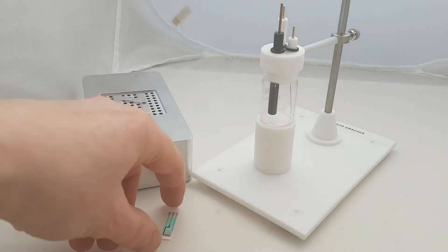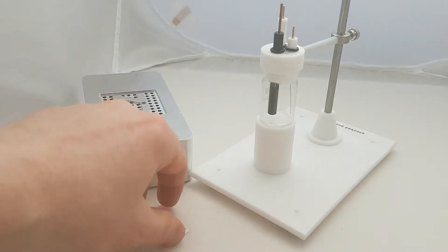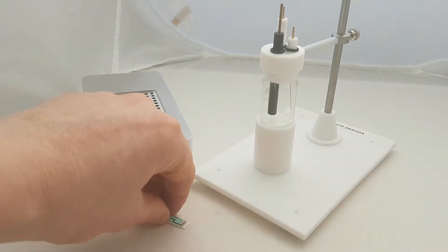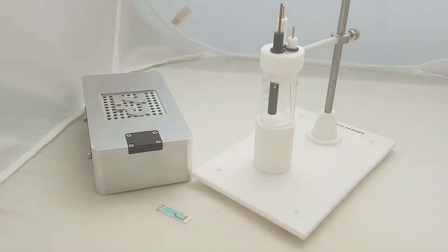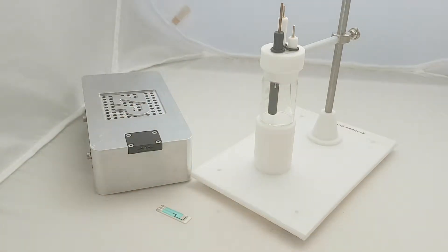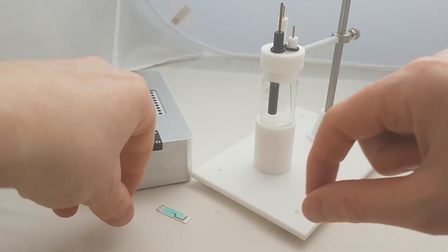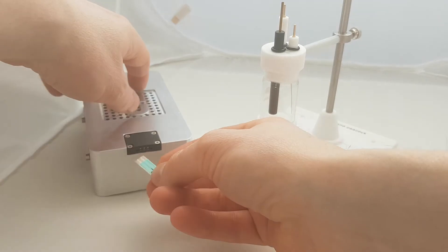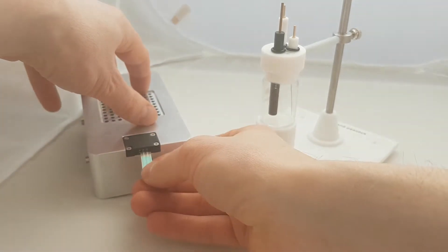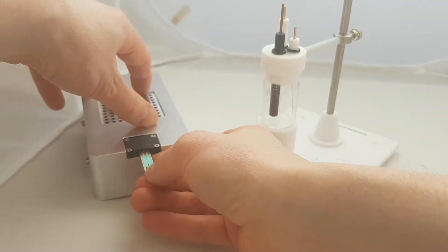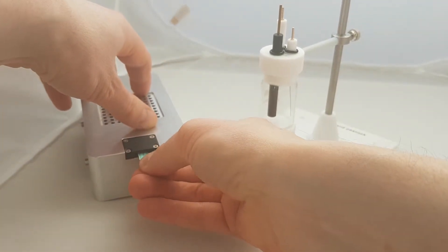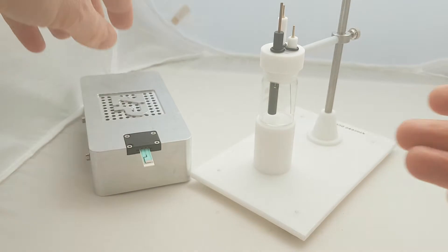At Zimmer and Peacock we're all about getting our customers and clients onto a disposable electrode configuration so they can start developing their sensor applications, maybe something like a point of care, so they can start developing their sensor applications.